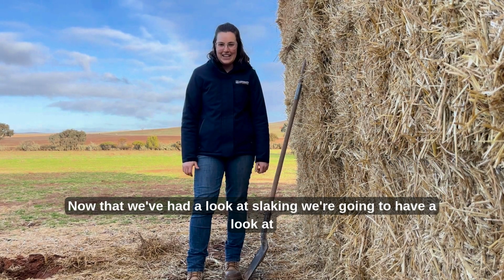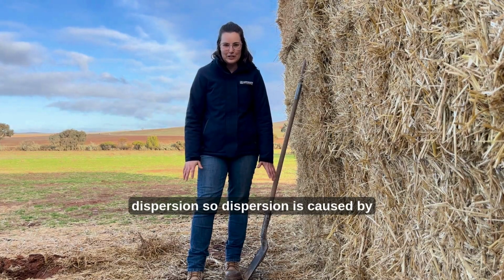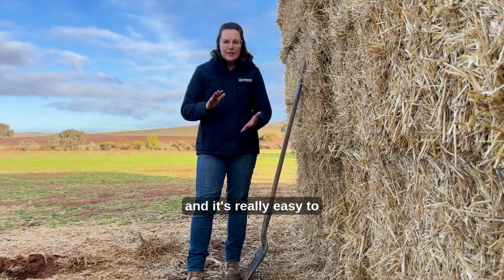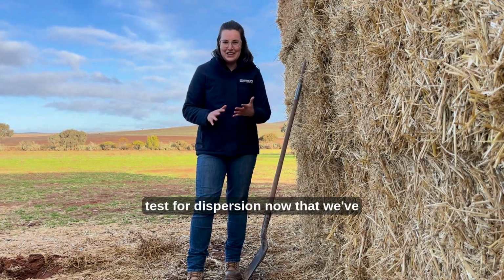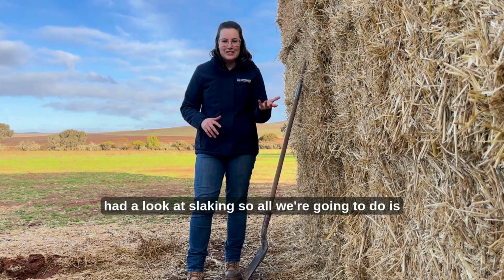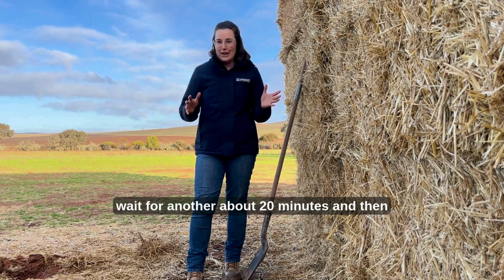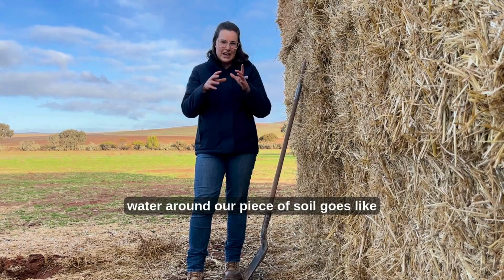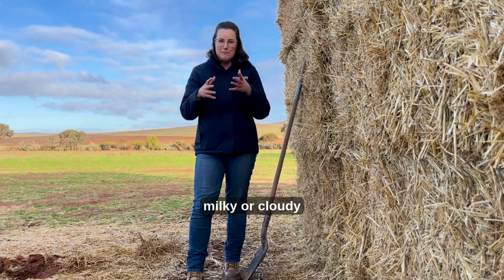Now that we've had a look at slaking, we're going to have a look at dispersion. Dispersion is caused by sodicity in the soil, and it's really easy to test for. All we're going to do is wait another about 20 minutes and then have another look and see if the water around our piece of soil goes milky or cloudy.